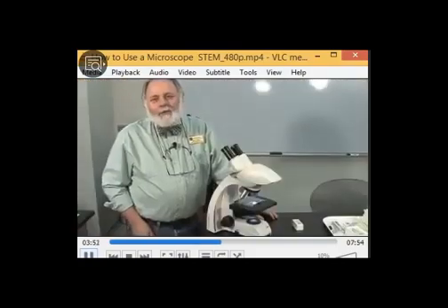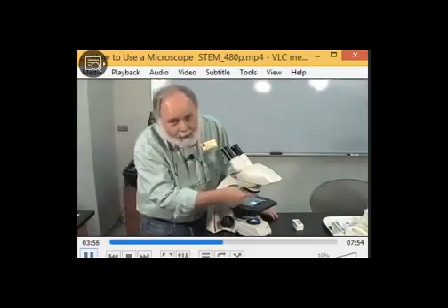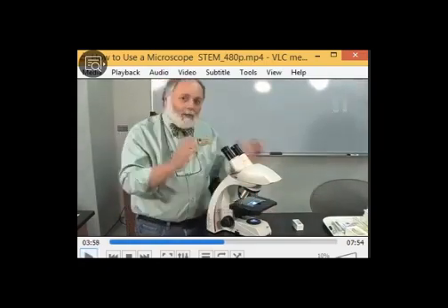You will put this slide in the microscope. Always start from 4x, the smallest. And you know 4x is called the scanning lens. Scanning means to scan. When you use 4x, it is for scanning, to find the specimen. So you locate the specimen. That is the function of 4x.